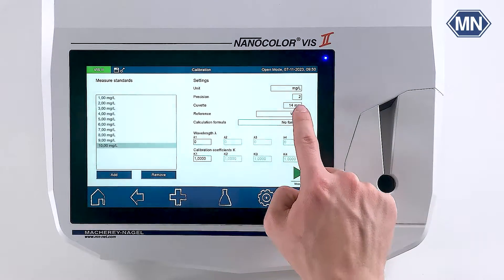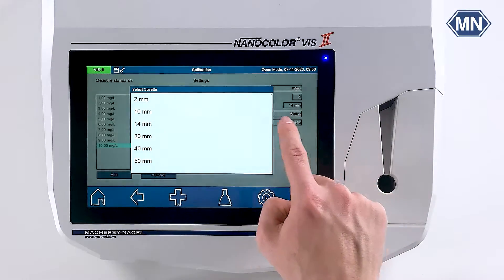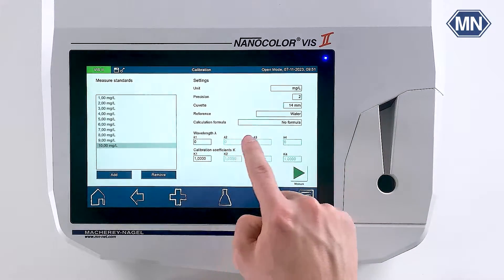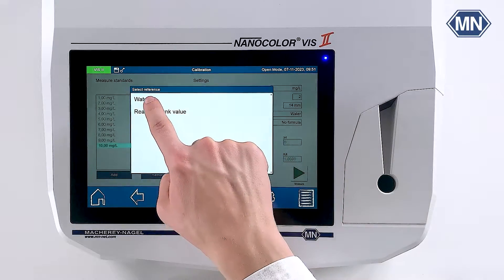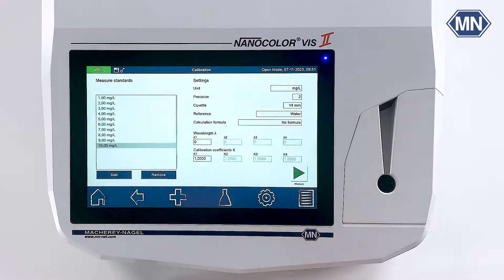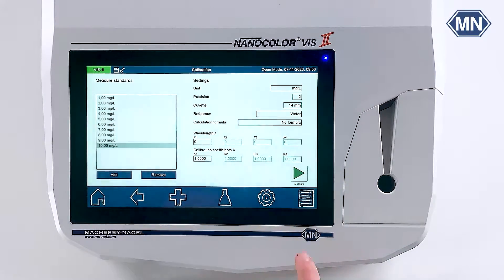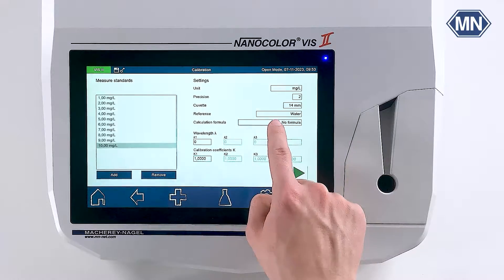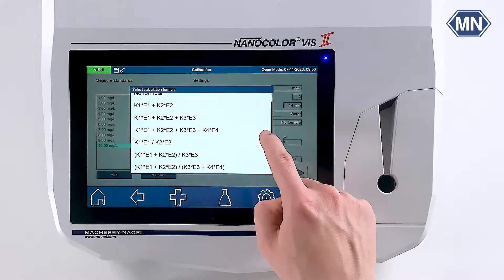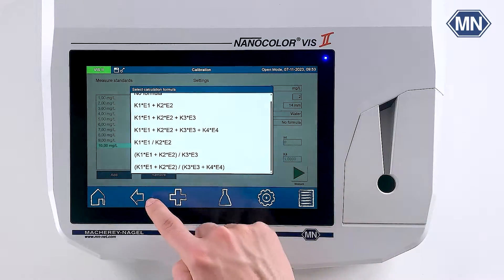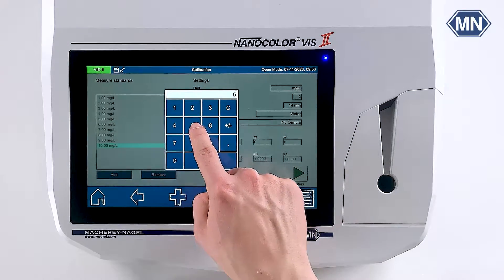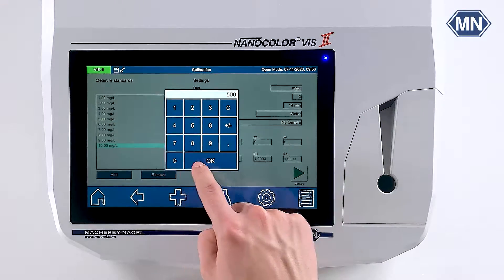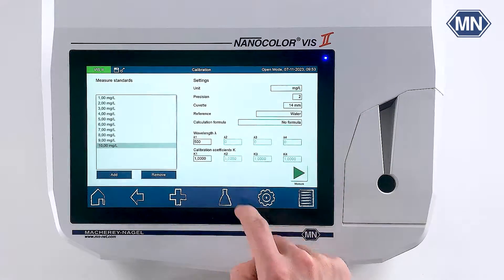Besides the unit and precision, you can choose the reference and the cuvette size. To calibrate more complex or multi-wavelength methods, you can select different calculation formulas. Enter the wavelength of choice in the field lambda 1.